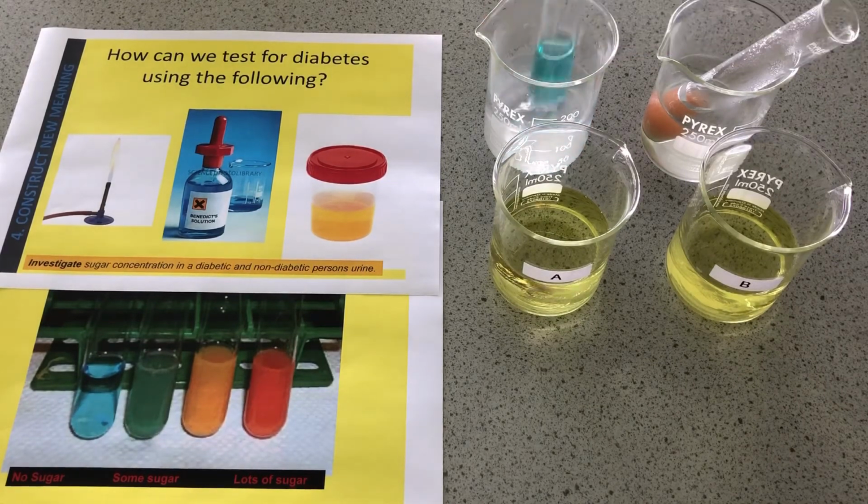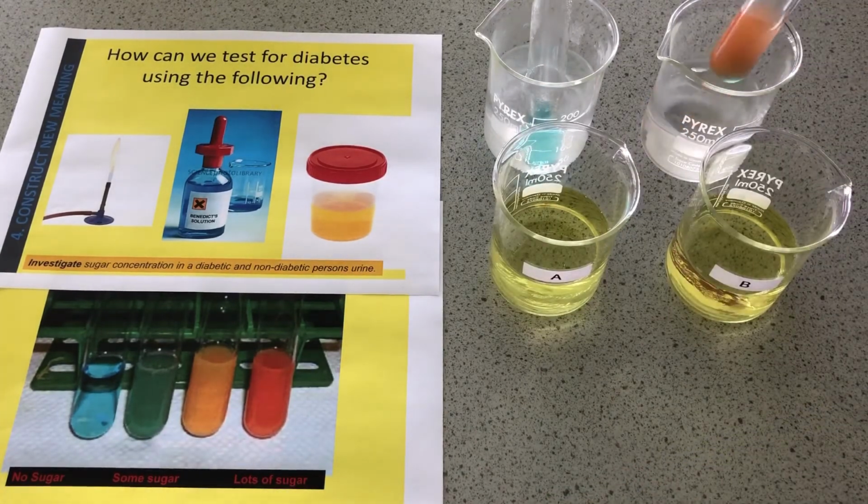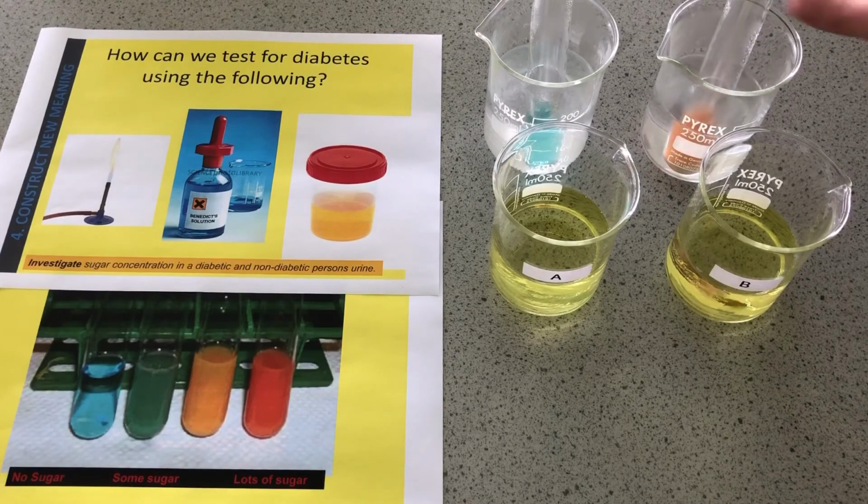So here we've got the same colour as the original Benedict's, the blue colour, so that's telling us from our guide here that there's no sugar in that one, and this one has gone that orangey colour on top, a little bit of green still underneath, so there's definitely sugar in that urine. This person, person B, is the diabetic.